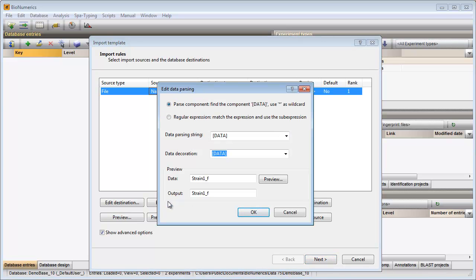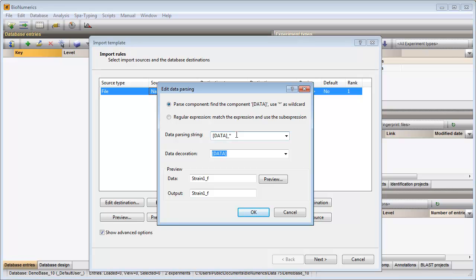In this dialog I need to specify which part of the file name should be retained as key information. This parsing string will omit all text appearing after the underscore. The correct part of the file name will be imported and linked to the key field.